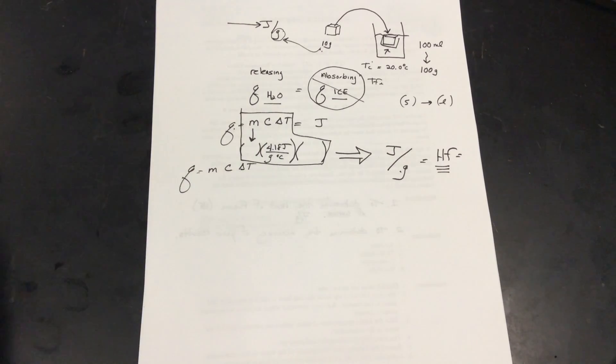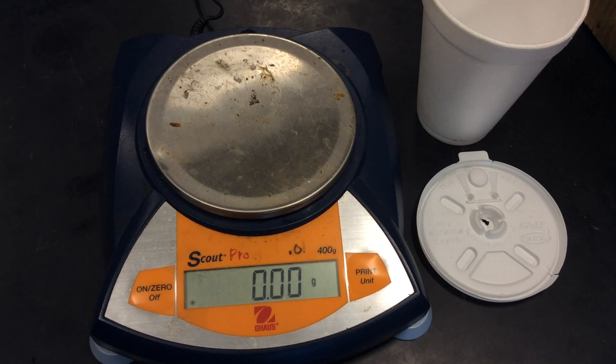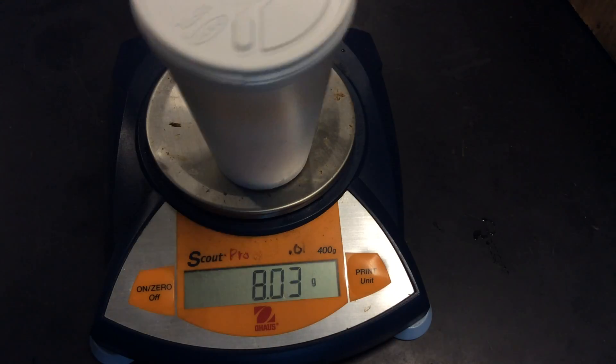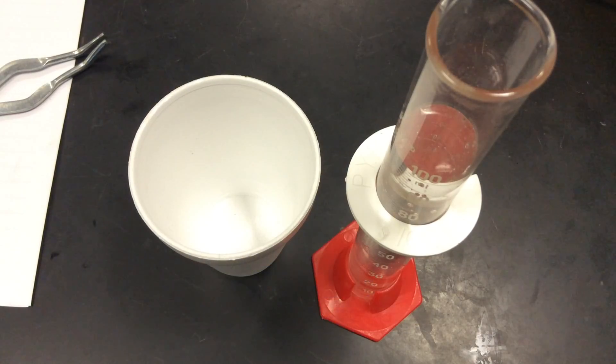Let's go on to the experiment. First, let's take the mass of the calorimeter. I decided to make the cup part of the system, which I'll explain shortly. I'm going to hit re-zero and put the cover on — this is our entire styrofoam system. You should write 5.49 grams for the mass of our calorimeter. I'm using 100 milliliters of room temperature water. If you use water directly from the faucet, it could be colder, which would add to your errors. We want the water to change only because of the ice cube.